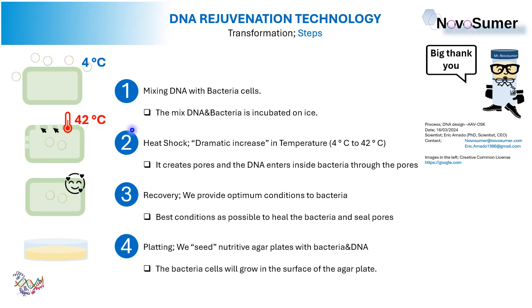The second step is, in fact, the heat shock, the dramatic increase in temperature. It will go from 4 Celsius degrees to 42 Celsius degrees. We will expose the mix to 42 Celsius degrees. It will last 30 to 45 seconds, no more.